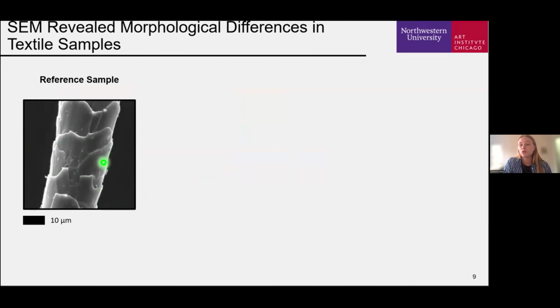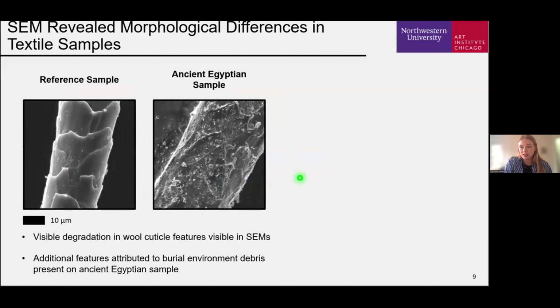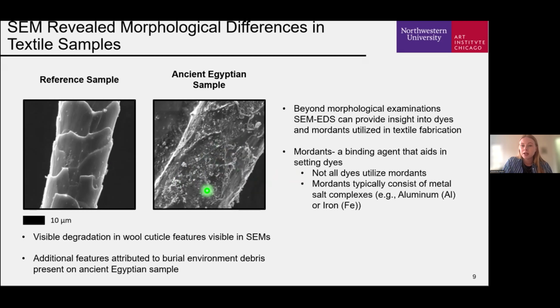SEM can provide insight into fibers present in textile samples, as exhibited by the micrograph here, with the representative cuticle or scale features commonly seen in wool fibers. In ancient Egyptian samples, these scales are present but less pronounced as a result of degradation processes. Furthermore, the additional visible features are attributed to dirt or soil remnants from the burial environment these objects are found in.